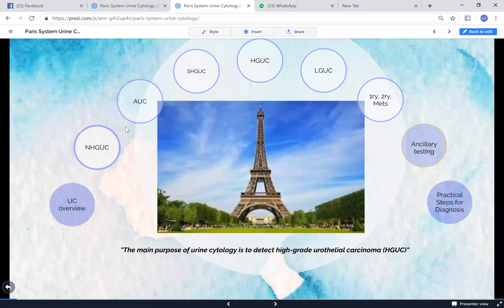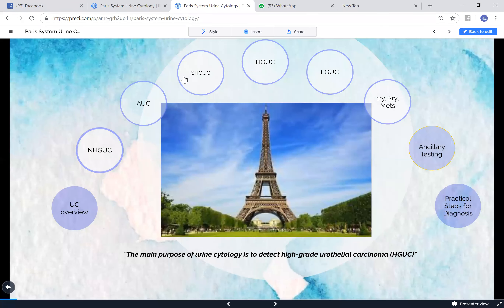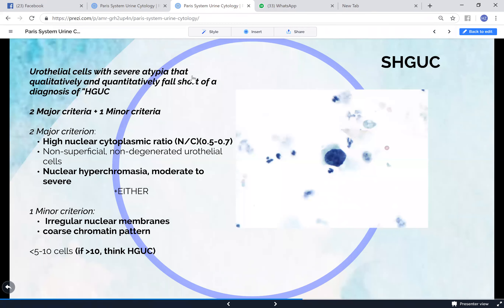Moving to atypical urothelial cells: there is one major and one minor criterion. The major criterion is an NC ratio greater than 0.5, in a non-degenerated cell that is not a superficial urothelial cell. From the minor criteria you need either nuclear hyperchromasia, irregular nuclear membranes, or coarse chromatin. A good example is a cell where the nucleus is almost exactly 50% of the cell, slightly hyperchromatic with a coarse chromatin pattern - this fits the criteria for atypical urothelial cells.